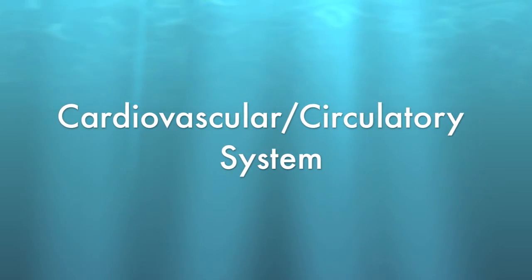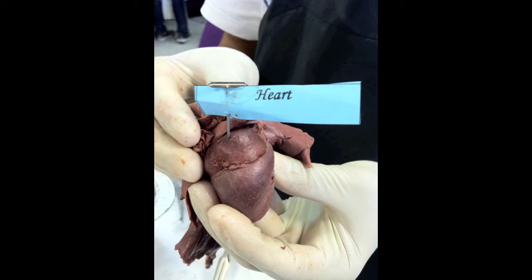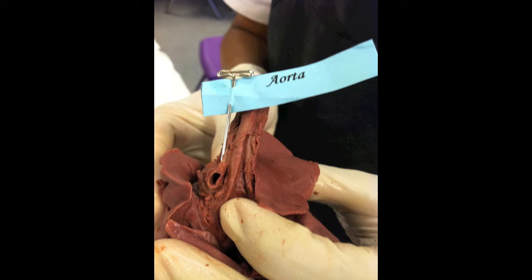The cardiovascular and circulatory system. The heart is responsible for pumping blood throughout the body via blood vessels. The aorta transports oxygenated blood from the heart to various parts of the body.